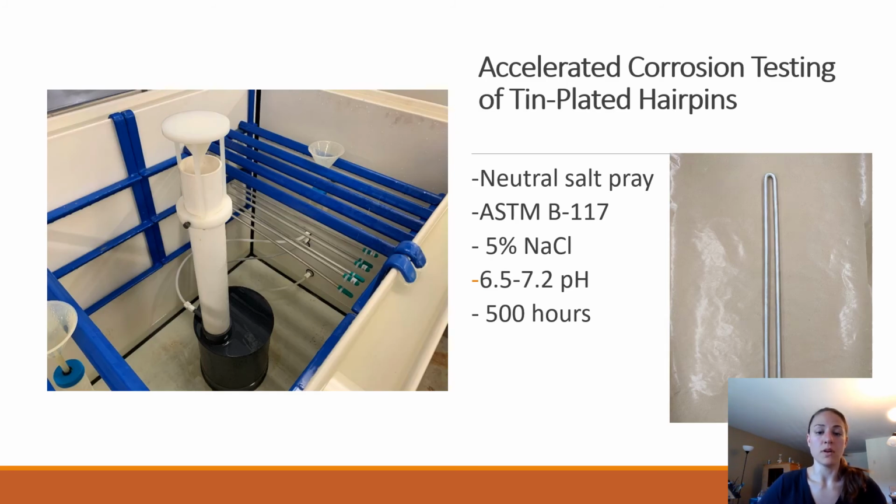So now I'll be going over a little bit of some analysis I've done at Modine. These tin plated copper hairpins are used in refrigeration units. Again, we use ASTM B117, and this was tested for 500 hours in the salt spray chamber in the picture on the left there.